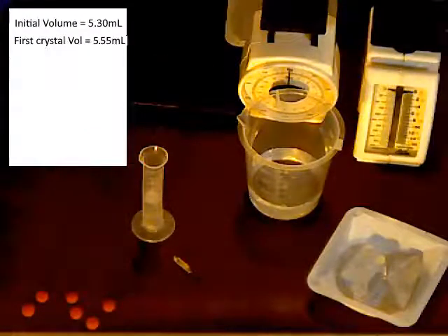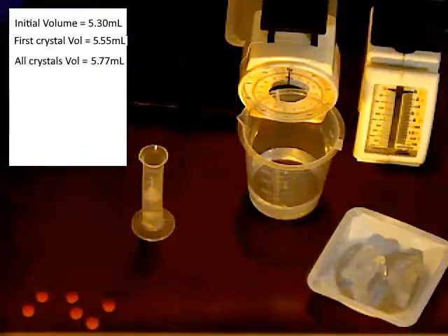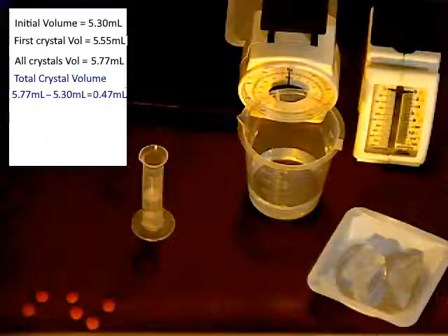The volume goes up ever so slightly, and I can make a reading and determine how much it increased by. Now I'll add my second quartz crystal, and the volume goes up slightly more because the quartz displaced some of the water, and I can do some subtraction to determine what those volumes are. Now that I know the volumes, I can find the densities.